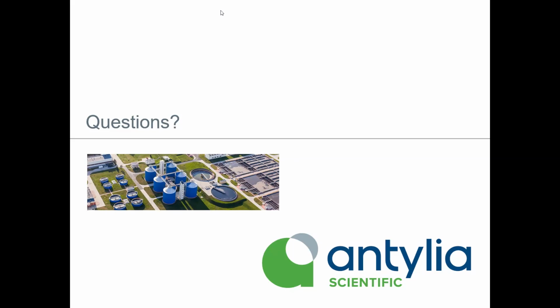Another question here, are there any new technologies that we need to be aware of? Yeah, technologies are always improving, and it's interesting that with pH, there hasn't been a lot of change since Dr. Beckman came out with the first pH electrode and meter back in, I think, the 50s. So pH hasn't really changed much. Conductivity has, the sensor quality and stability has improved quite a bit over the years.